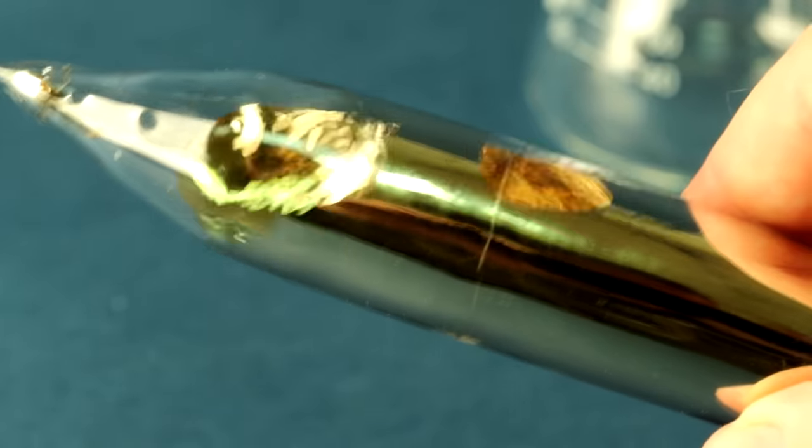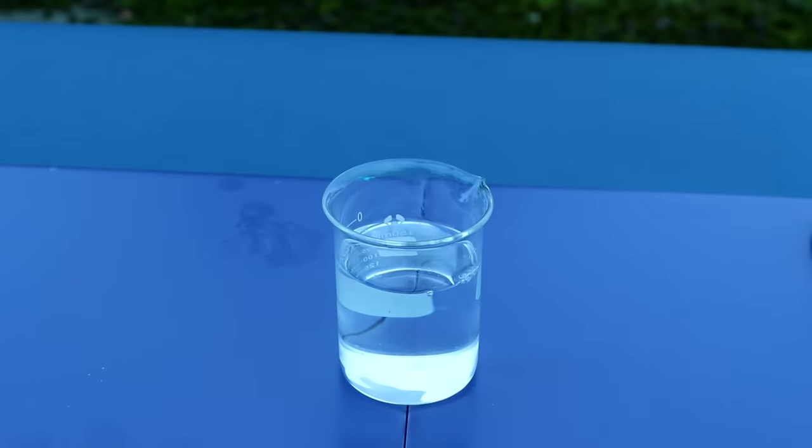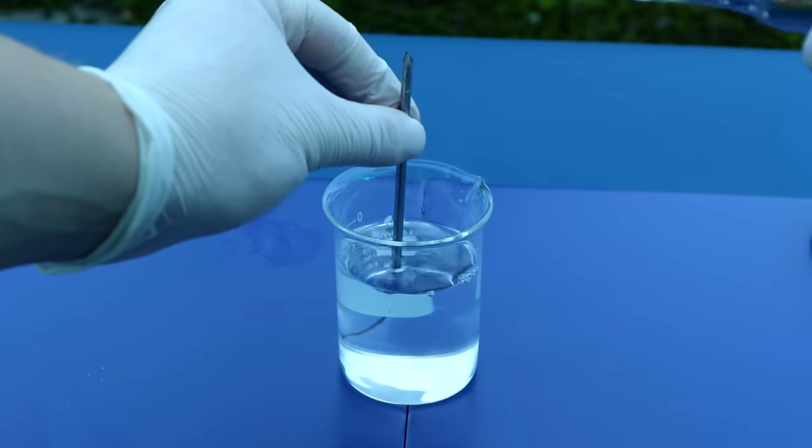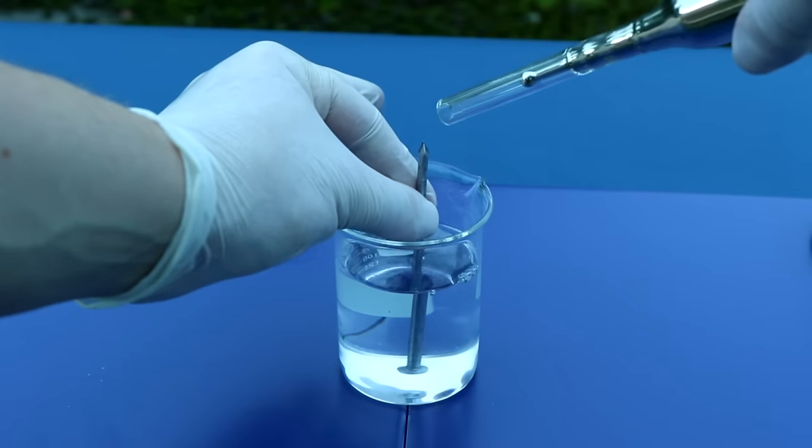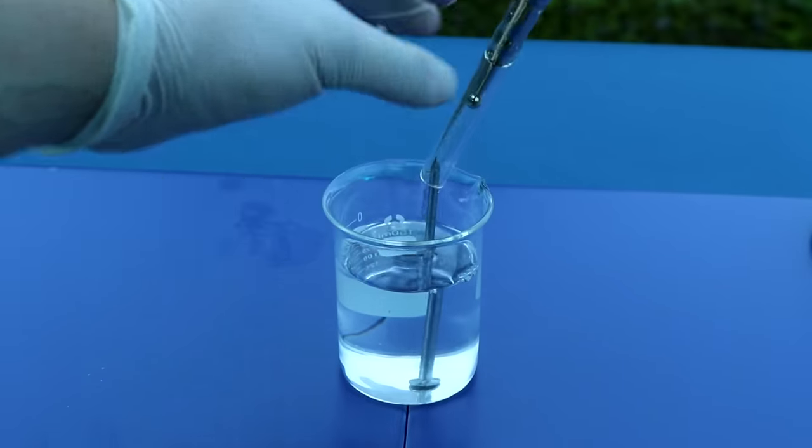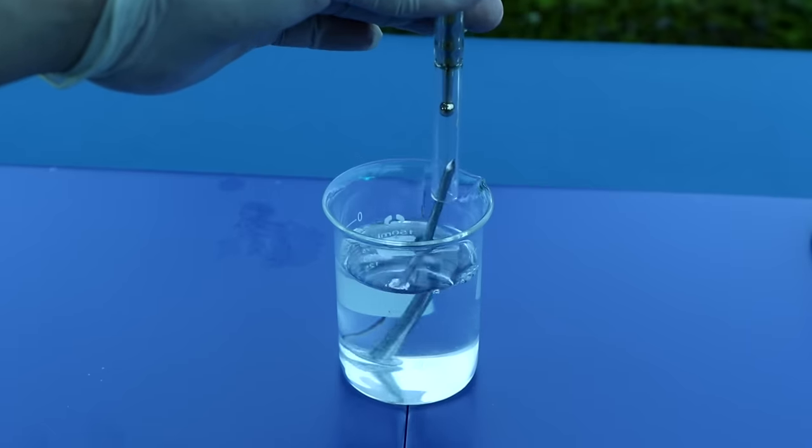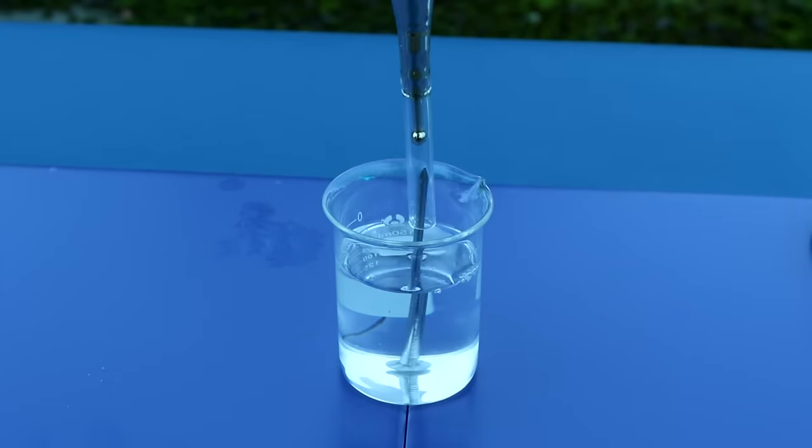Now, let's proceed to the most interesting part, conducting experiments with cesium. First, to get the cesium out of the vial, I decided to melt it in the vial and then pour out the liquid cesium in kerosene.